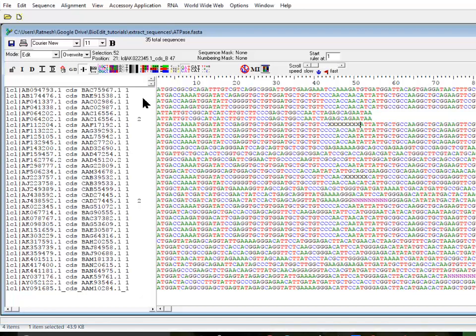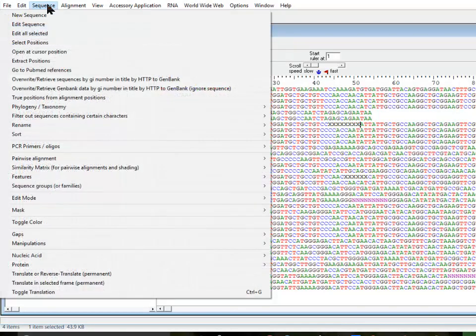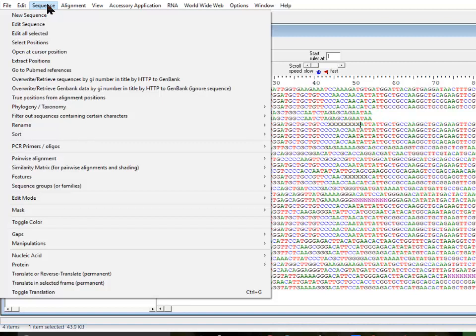This is a continuation of the previous video on sequence extraction from a set of sequences. In this one we're going to talk about a few methods to filter out sequences based on the characters they have in your sequence.